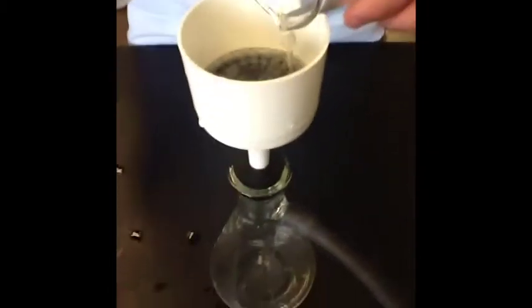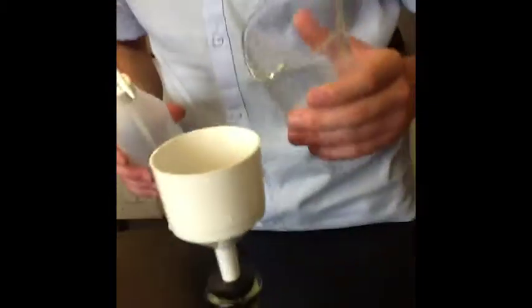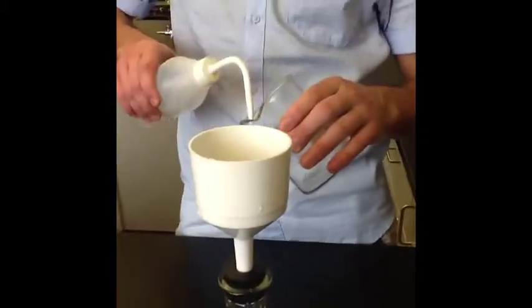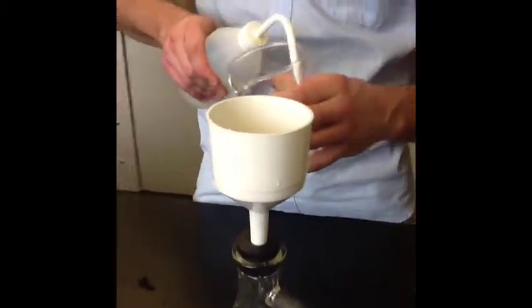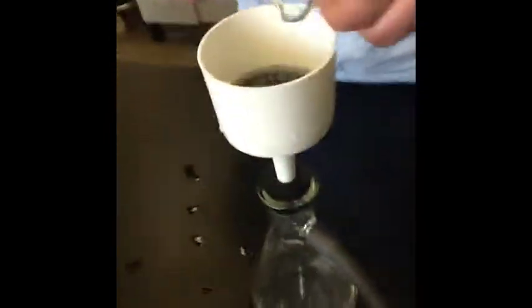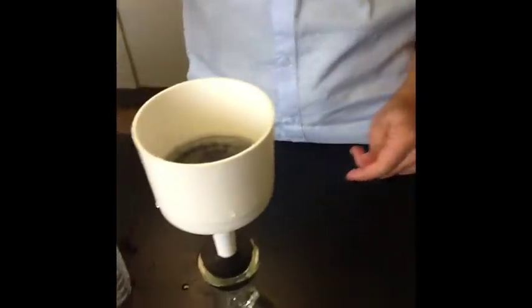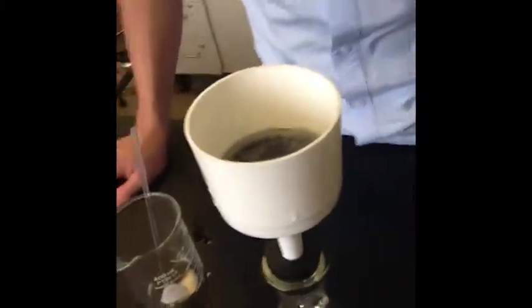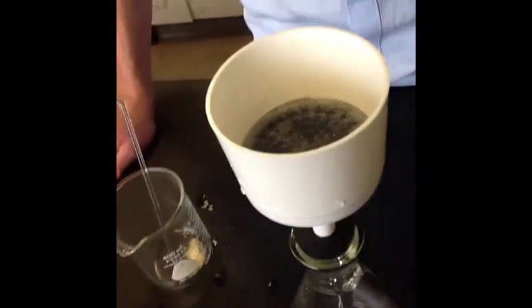You kind of dry it out because the acid can react to the water. And see what Nick did when he added the distilled water into the beaker is he's trying to get all of the solution out. He's trying to rinse it all, and so it can all filter. And the black stuff is just some waste that we don't really need. It's carbon. Some sort of carbon.